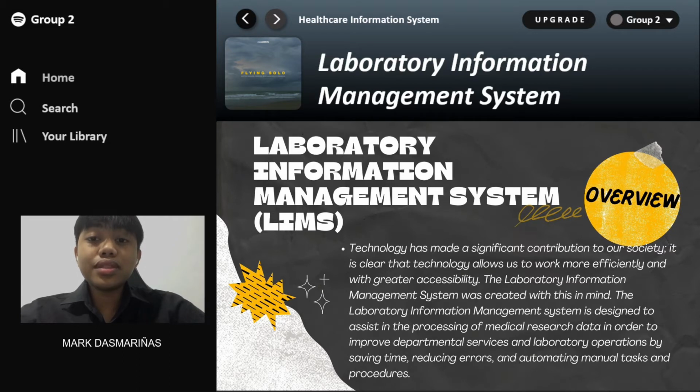As we can clearly observe, there are numerous benefits of the LIMS. Not only does it benefit the workers, but also the patients, because it ensures reliable results and decreases human errors. This results in efficiency and greater work output.